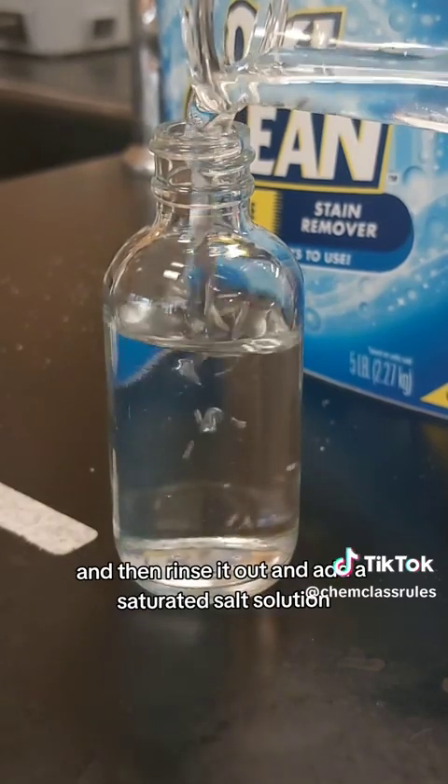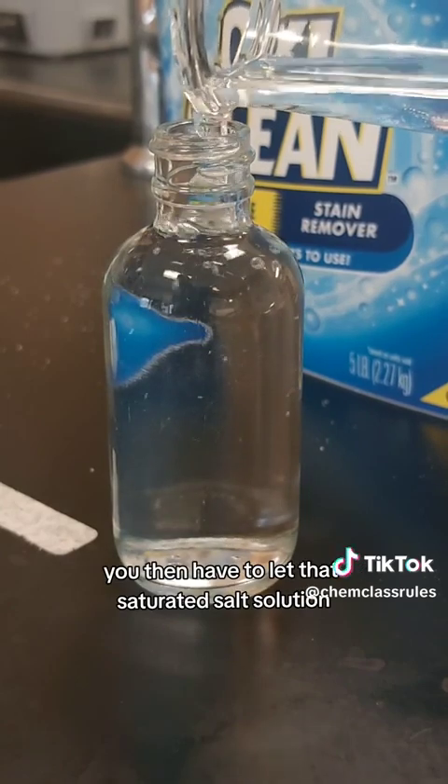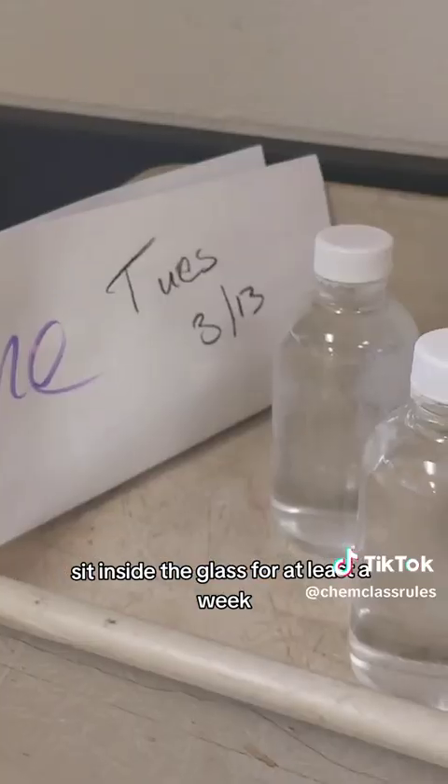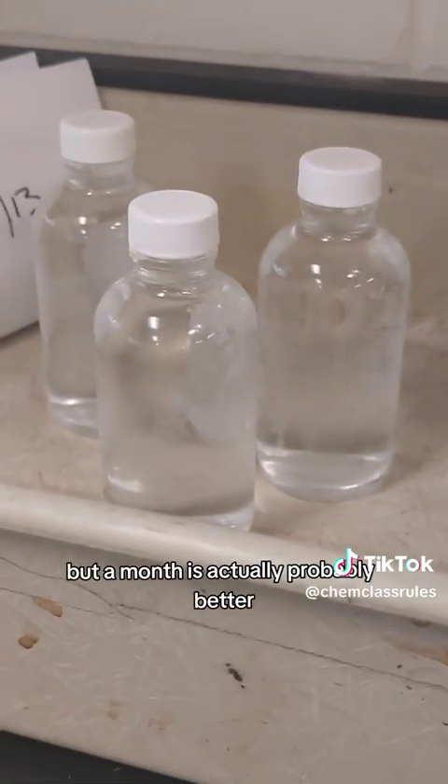Add a saturated salt solution and let that sit inside the glass for at least a week — but a month is actually probably better.